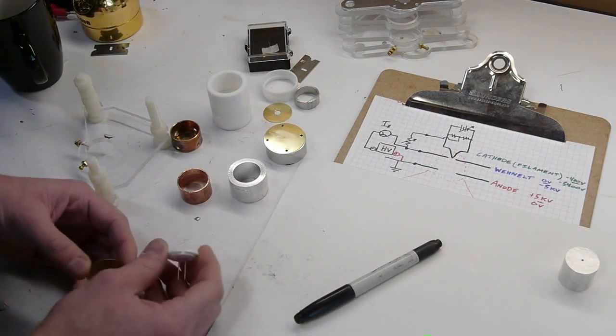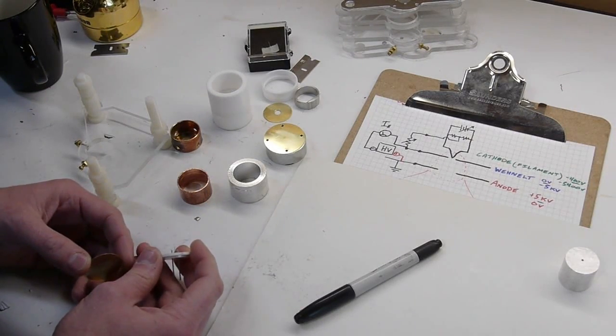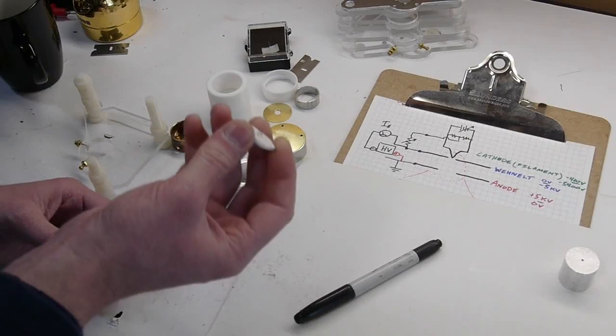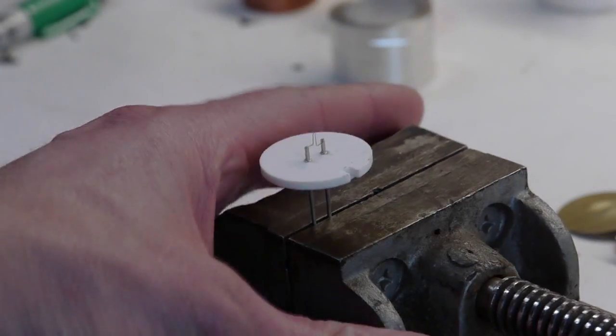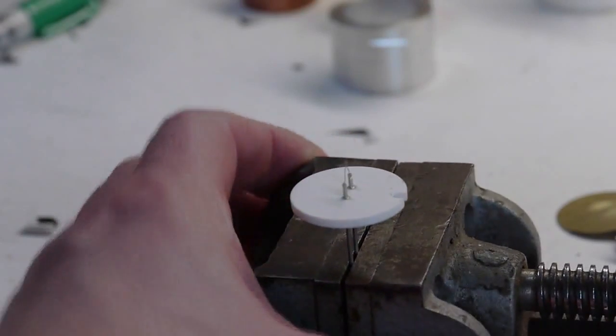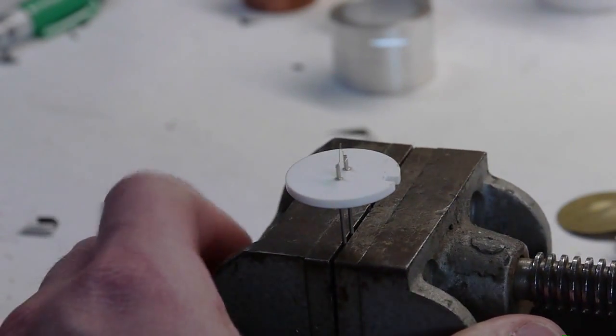So that's a tricky machining job. The filament itself I think is about a hundred microns in diameter. I'll get some close-up shots of these. Okay, so I hope that gets the basic idea down.